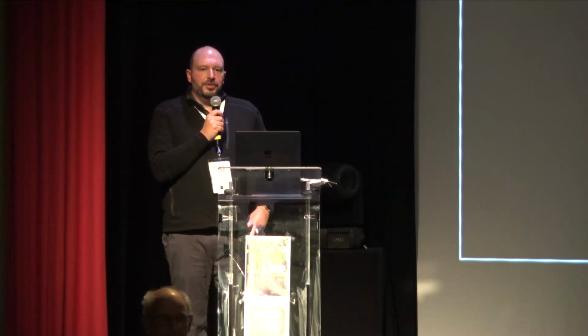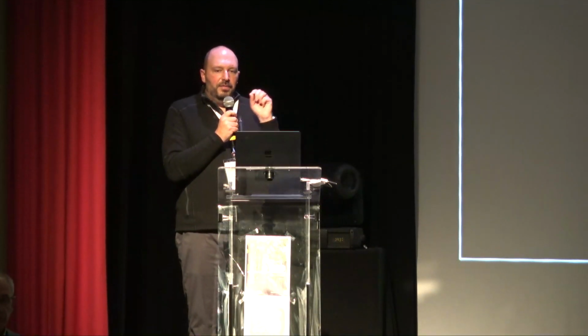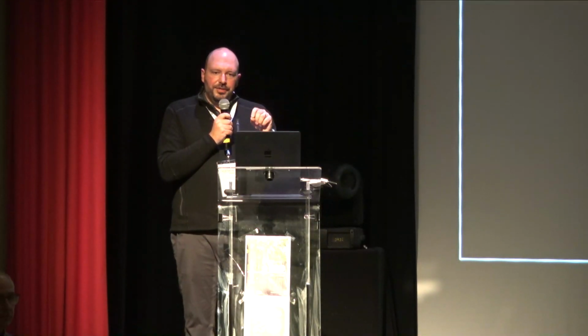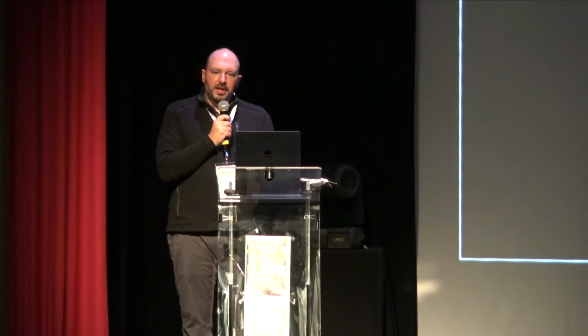Right, so the question is about this Voltron system. Yeah, so the nice thing about the Voltron system is many of the fluorophores that we've developed are bioavailable. So you can use them in animals. So in the original paper and in subsequent papers, we've shown that you can load in mice and in zebrafish and even in flies. Flies are harder, you usually have to pipette it onto the brain.